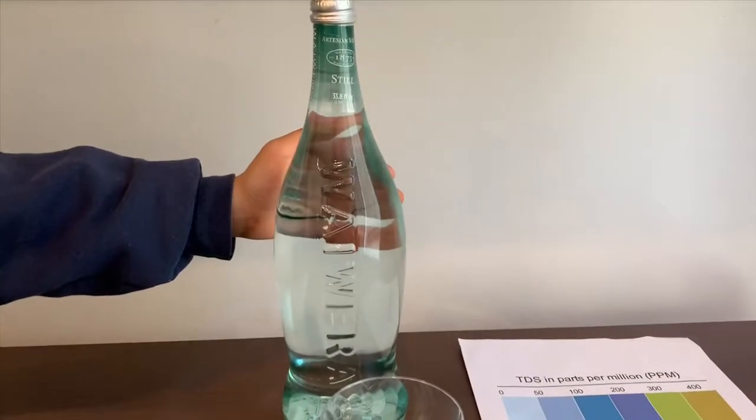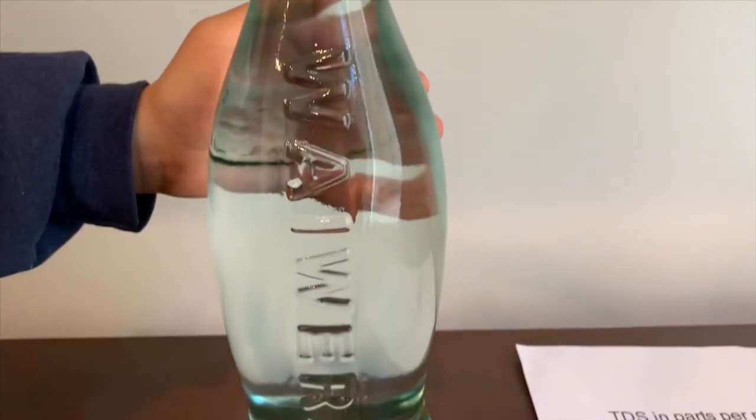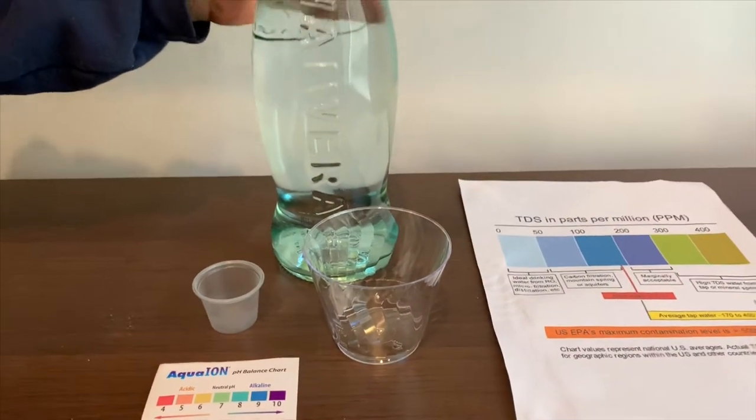This is why we're looking at Still Water. It costs $3.99 and is sourced from New Zealand. Let's test the TDS and pH levels.